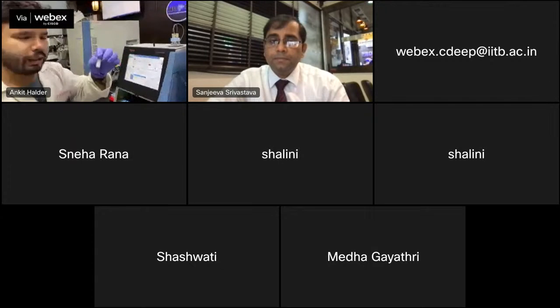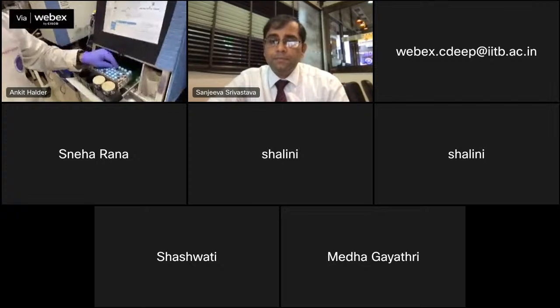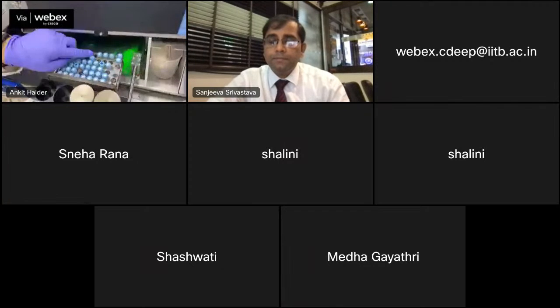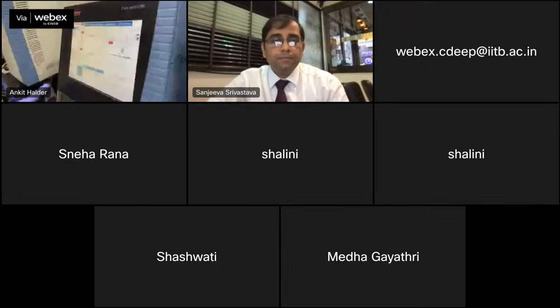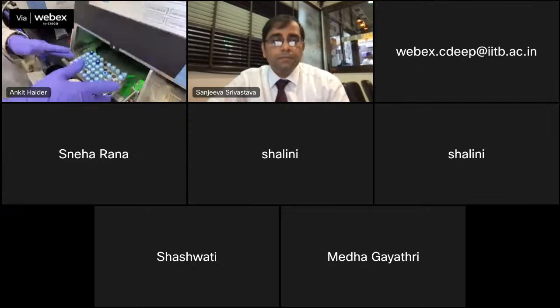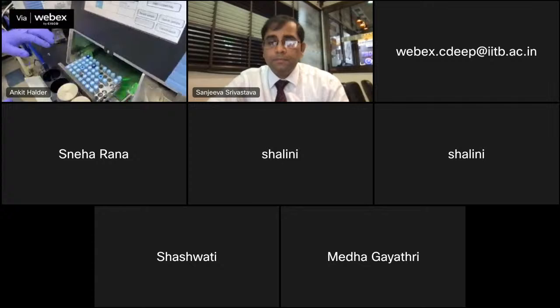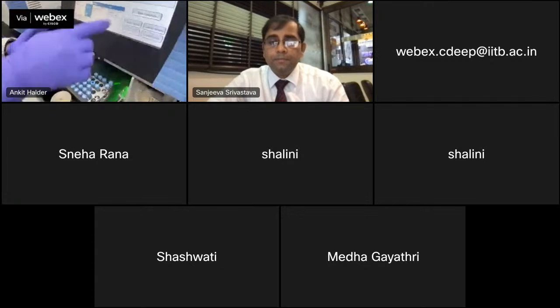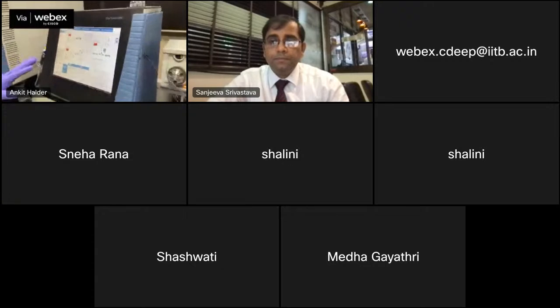And once the sample is prepared, we just place it in the autosampler, right? So this is the autosampler. We can prepare samples in this plate format. We can take at least 96 samples in a single shot. So we'll place the sample, and then we can start the acquisition process.